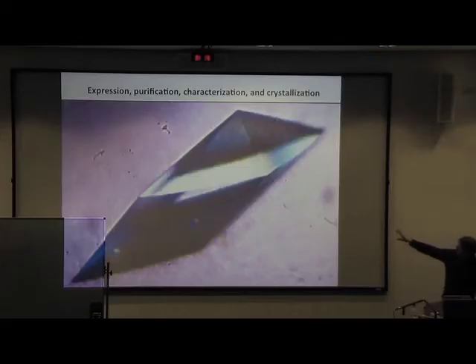It's usually worse. Well, I must say, I had a case where it helped. These crystals were so big that I couldn't cryo cool them, because when you put them in the cryo buffer, they would just crack. So big crystals are not always better, as Jan already mentioned earlier. They're actually very tricky to handle because you get such temperature differences from one end to the other, and osmotic differences. They look very pretty, but they were not very practical, and I had to go to smaller ones to get good data. Okay, thank you.